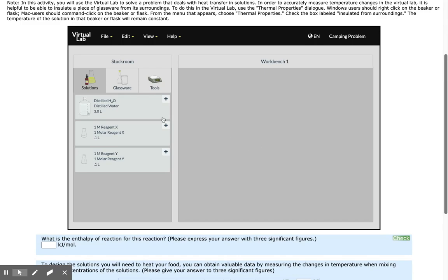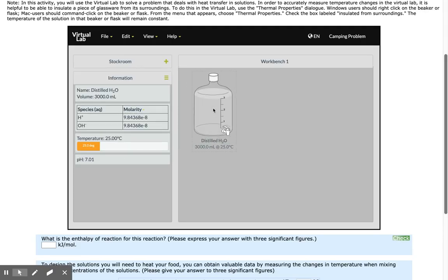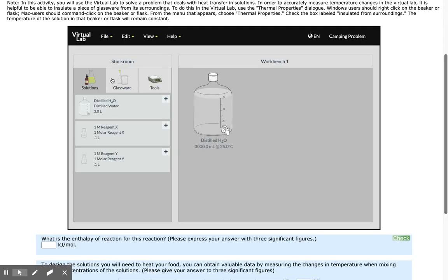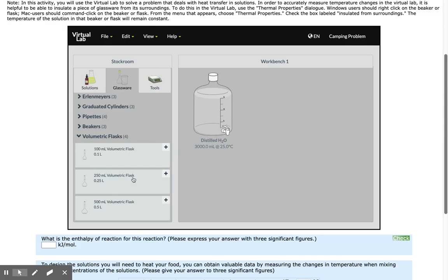I'm going to start with Reagent X. To begin, I need to gather distilled water from the stock room and a 250 milliliter volumetric flask.